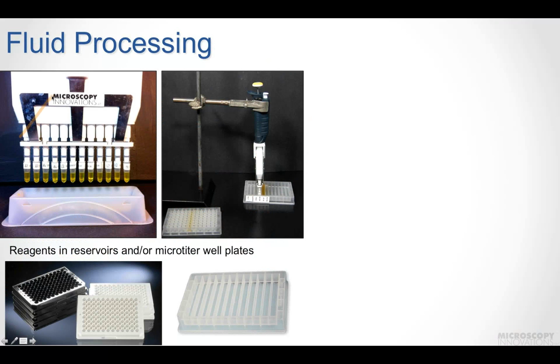So here we have a 12-channel pipetter with 12 mPrep S capsules filled with uranyl acetate for en bloc staining, and this is above a reagent reservoir. 100 microliters of this en bloc stain was pipetted into the capsule, and it's held in there just like your child will hold fluid in a straw when you're out at a restaurant to embarrass you. So a little drop might form on the bottom, but as you can see, the specimen is fully immersed in the stain.